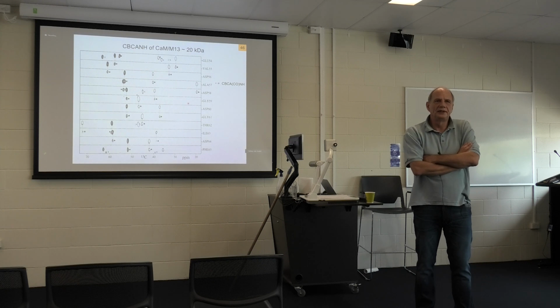In general, I think the shaped pulses are longer, no? And so you have additional relaxation. You have to think exactly what this does. In practice, for the HNCA and the HNCO, I never saw really strong artifacts from just using rectangular shapes.